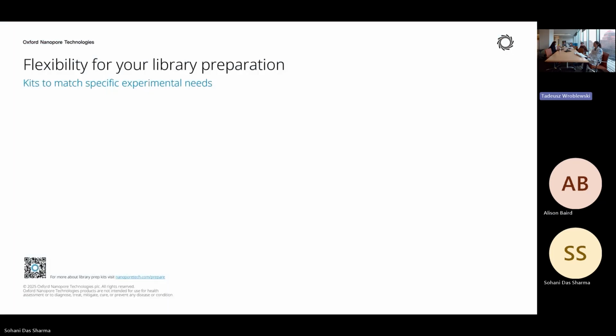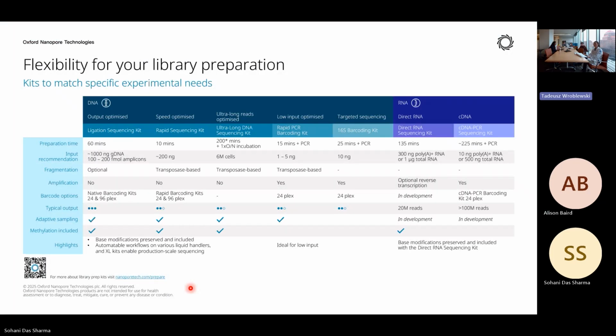Okay, I am going to talk a little bit more about RNA sequencing, and at that time, if you have any additional questions, I'm happy to answer. Can we polyadenylate the small non-coding region, and then sequence it? Yeah, that's what I meant by internal polyadenylation. We do have a protocol, but okay, let's go to the RNA sequencing slide, then we can talk more about it.